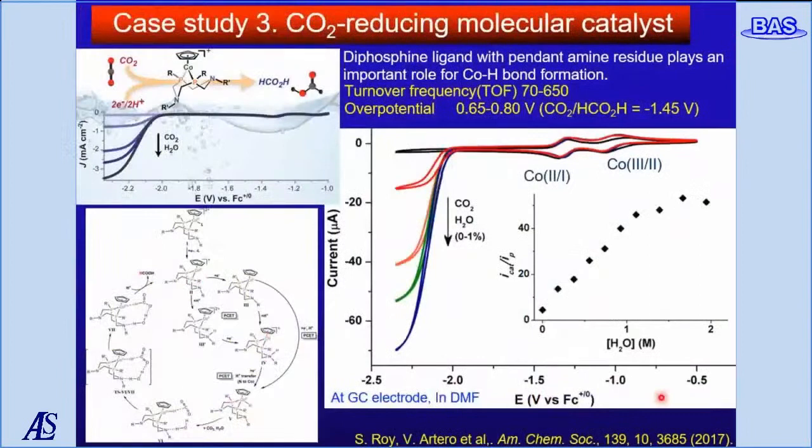The activation and catalytic conversion of small molecules such as hydrogen and carbon dioxide is one of the most important research targets these days. Recently, many reports have been published on electrocatalysts, in which the catalytic activity is evaluated by electrochemical methods.